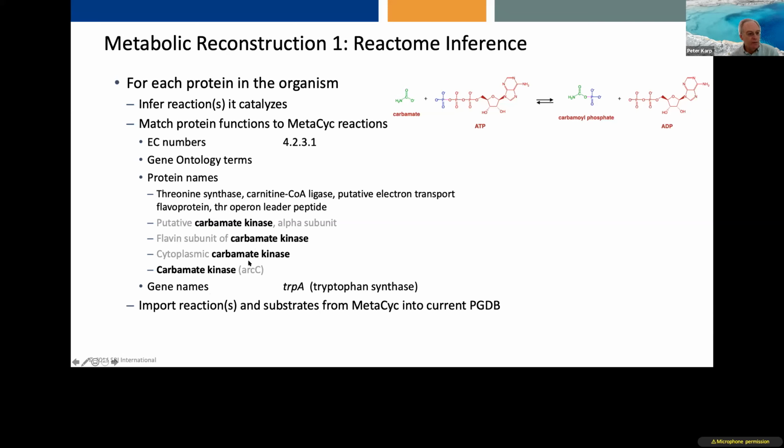Finally, if we still have not gotten any match for this protein, we will look up the gene name if one is provided, because gene names can be used to identify metabolic reactions as well.